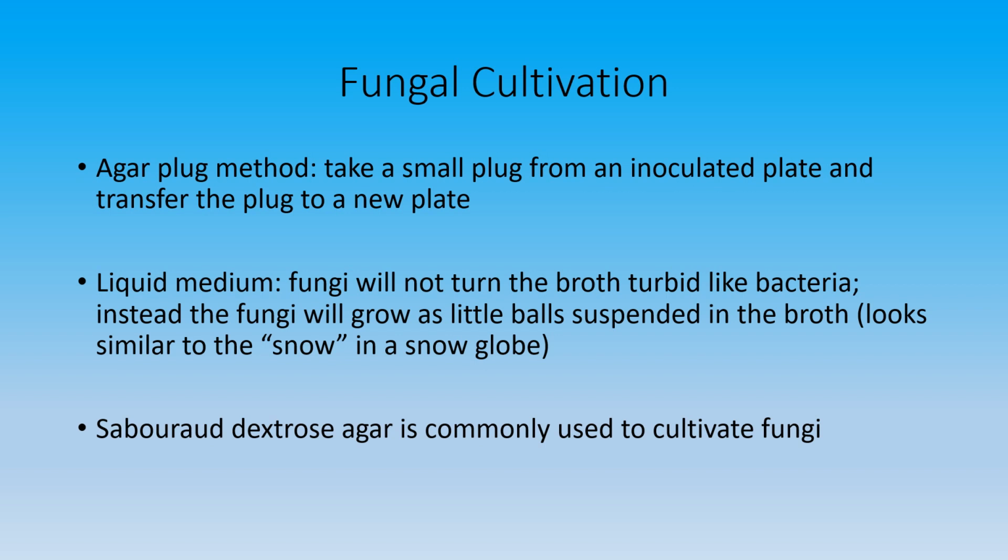Sabouraud dextrose agar is specifically an agar that is designed for cultivating and growing fungi. The pH, excuse me, is slightly acidic to favor the growth of those fungi.